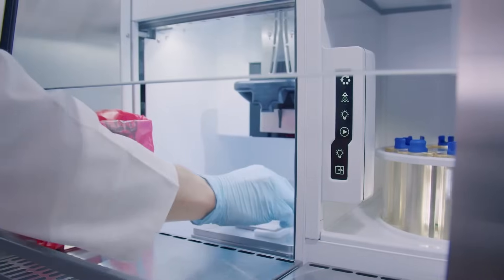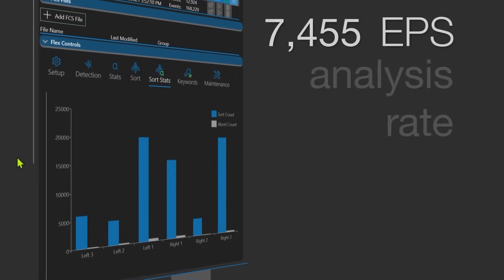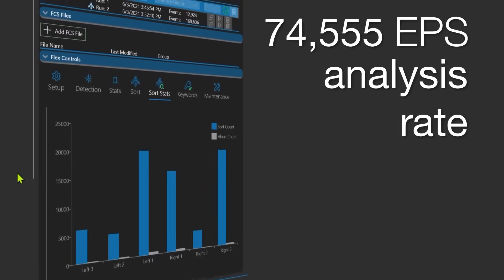The Bigfoot Spectral Cell Sorter offers sort rates of more than 70,000 events per second and analysis rates of more than 100,000 events per second.